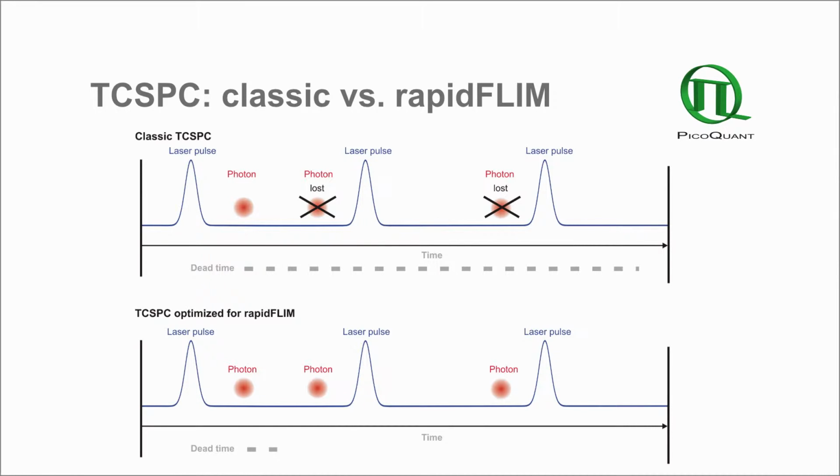To avoid the pile-up effect in conventional FLIM measurements, the count rate must be reduced so that statistically only one photon after every 50 to 100 excitation cycles is recorded. This, in fact, leads to long acquisition times.